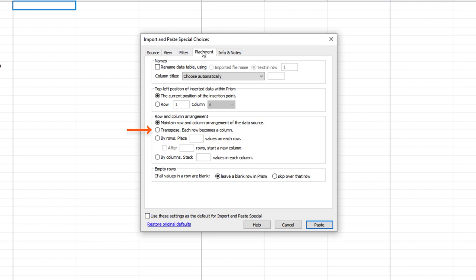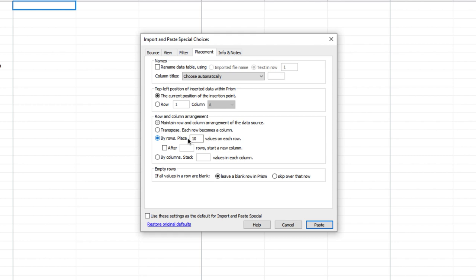You can choose to transpose your data or to insert your data by columns by stacking a certain number of values within each column. Now, I know that in Prism's grouped data table, replicates run across rows. And I also know that in my data, my replicates already run across rows in order of time point. But the number of values I have in any single row is wrong in my source data. So, I'm going to select by rows. My measurements are in triplicate, and the data table is set up accordingly. So, I'll say place three values on each row. Finally, I know that each group has measurements at eight time points represented as eight rows. So, I can indicate that by selecting after eight rows, start a new column.